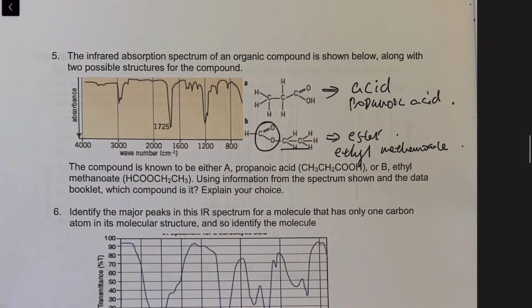So from this infrared spectrum, we didn't see a broad absorption in the 3500 to 2500 region. So you know it is not an acid. So it must be an ester, since it has the C=O double bond absorption. So the correct answer is B.